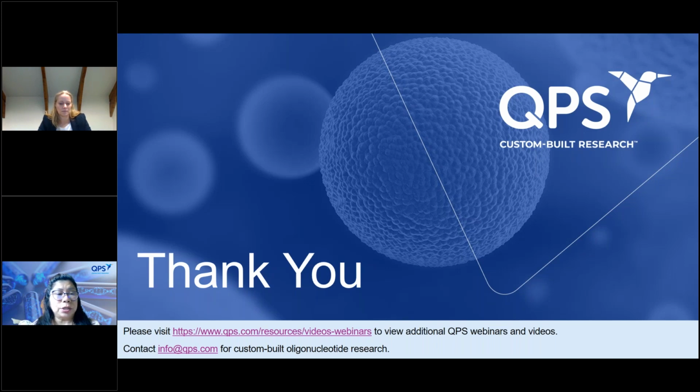Our first question: how do you recommend which hybridization approach is selected?